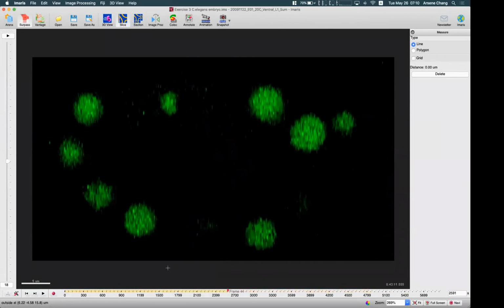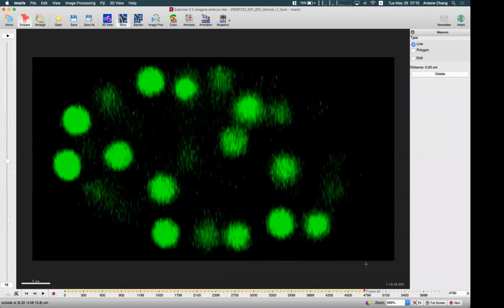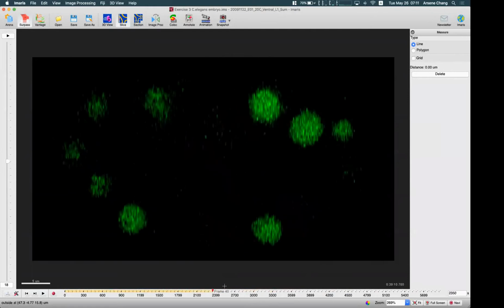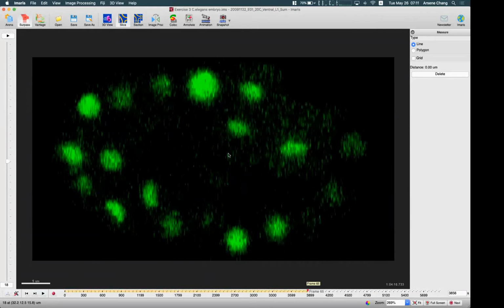For the division samples, the cell right after the division will be smaller, and prior to the division maybe larger. So, like a spot creation, you may want to use a medium-sized cell as a reference. Here it is 3.39, here is 5.62. So I may use a number in between.